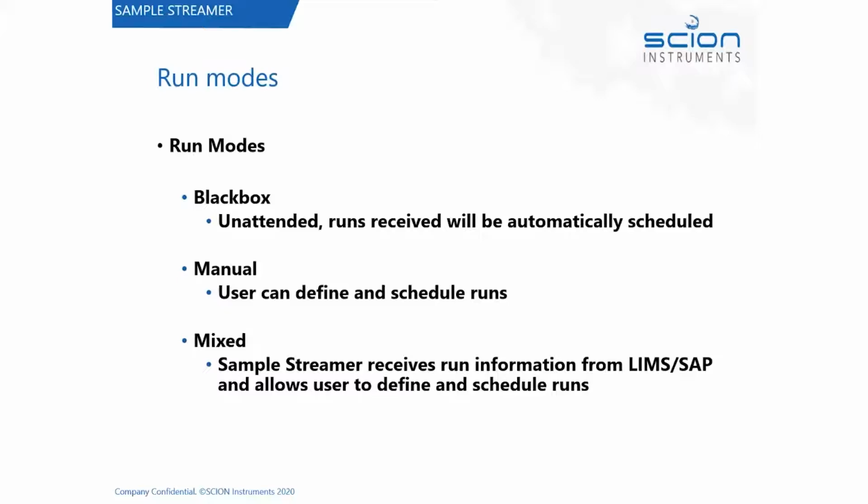So you can have it completely invisible, just working at your PC and all of that's going on in the background. You can run it in manual mode. We talked a little bit about that at the very beginning, where you have a screen and you can enter samples manually, or you can have automated runs coming from the LIMS as well.